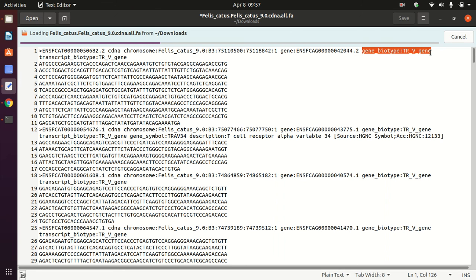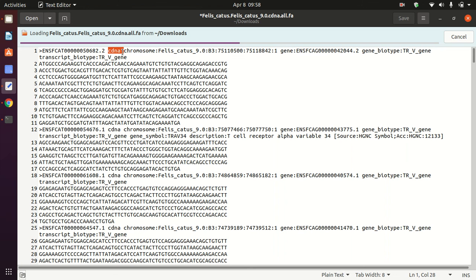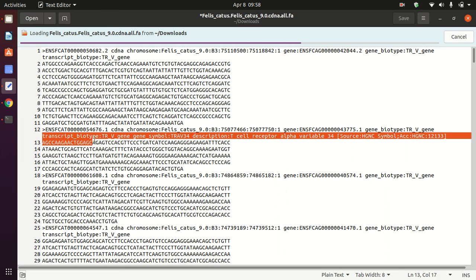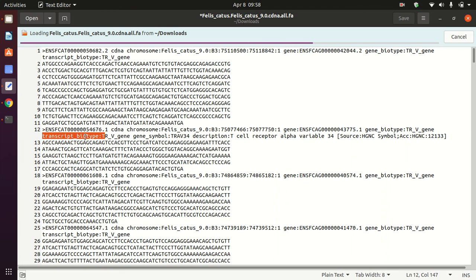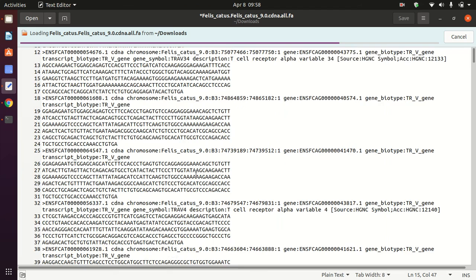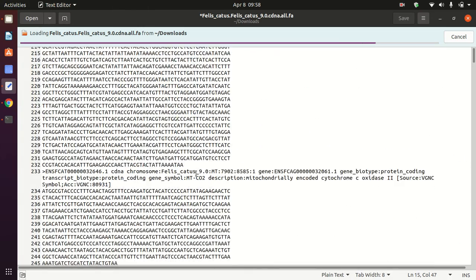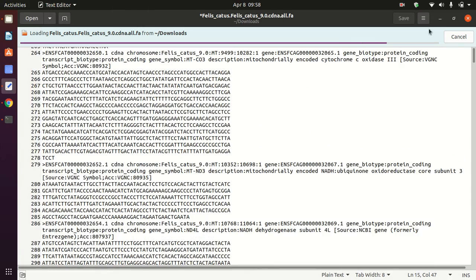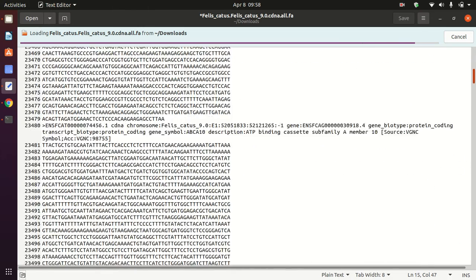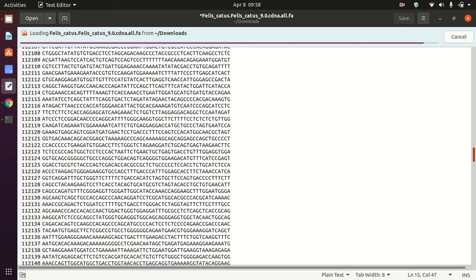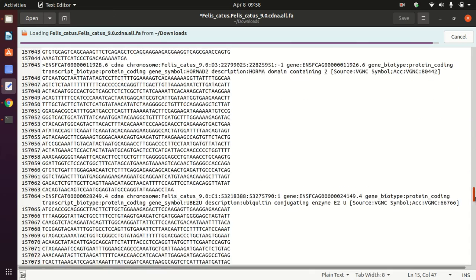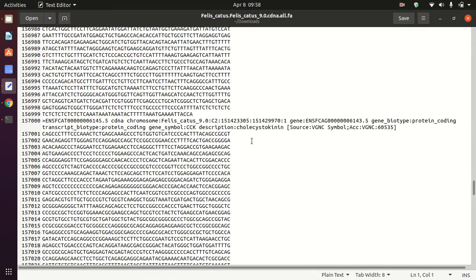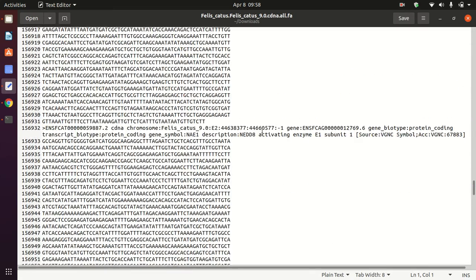This is the FASTA file, and all the genes are available for the particular species that I searched for. It's cDNA, so you have all the transcripts - every transcript you'll get from this cDNA file in FASTA format.